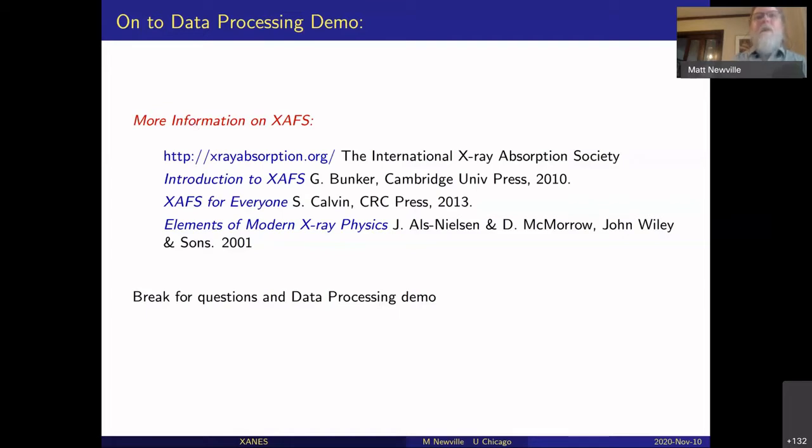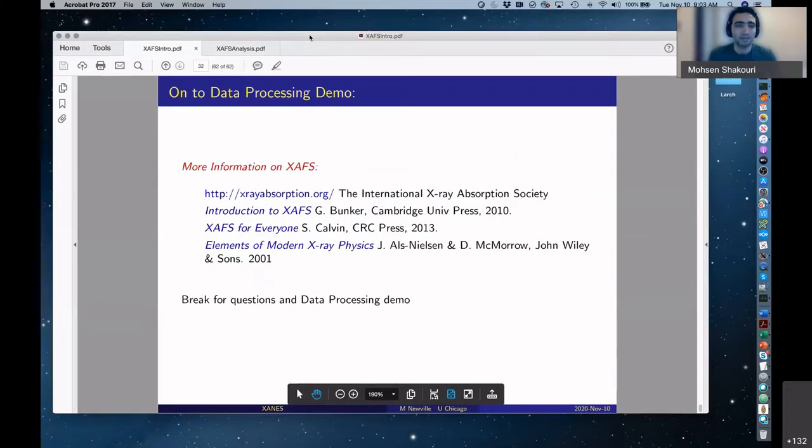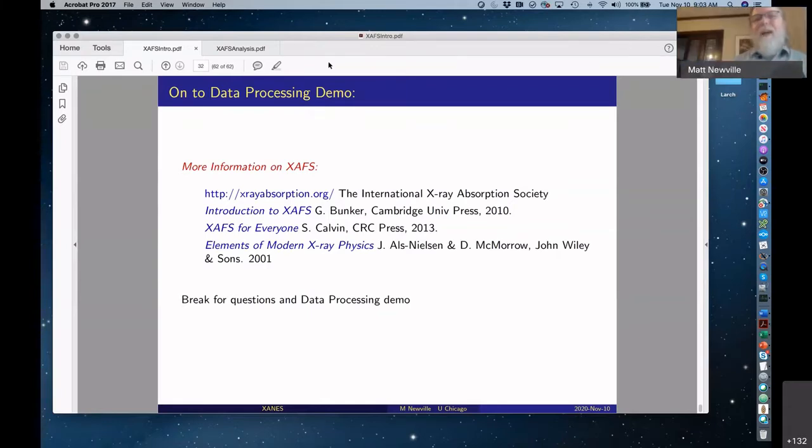Hey, Matt. There are a couple more questions. One of them is, can you differentiate between sulfur and chlorine? And I believe it's about the higher shells, not the core atom. That is hard. As the neighboring atom in extended XAS, I would say don't count on that happening. That would be extremely difficult to distinguish.